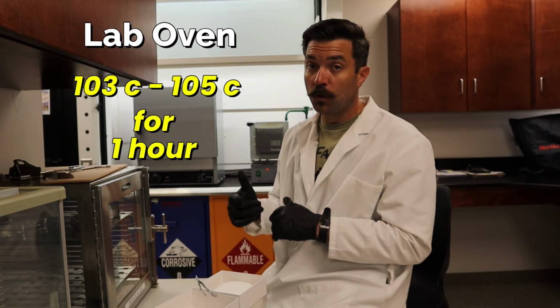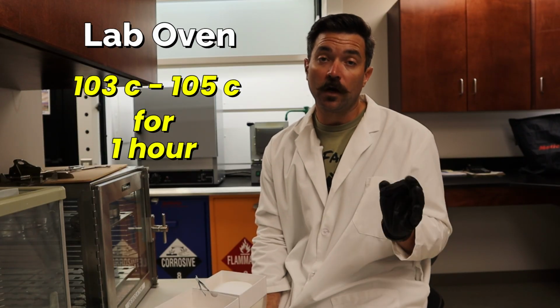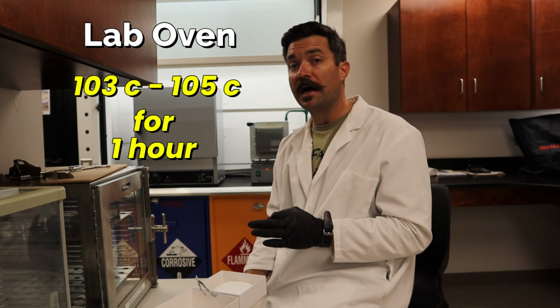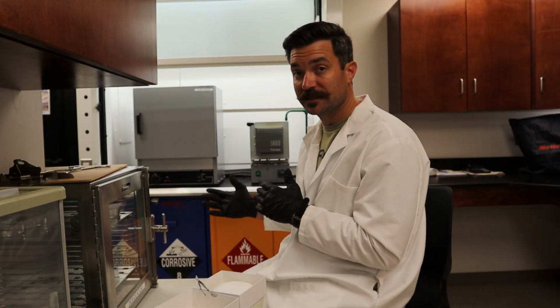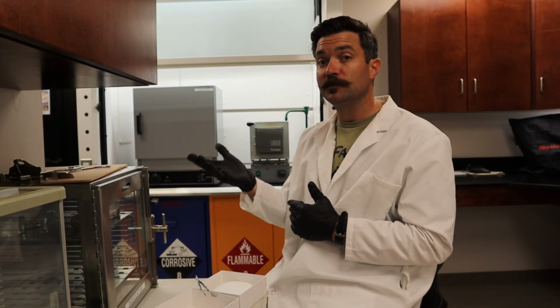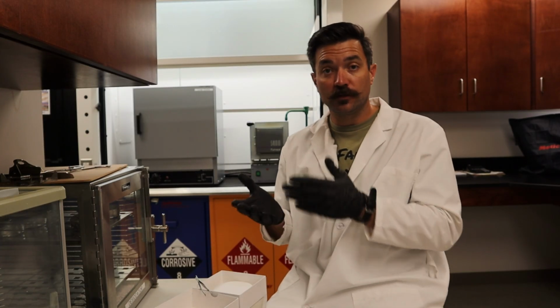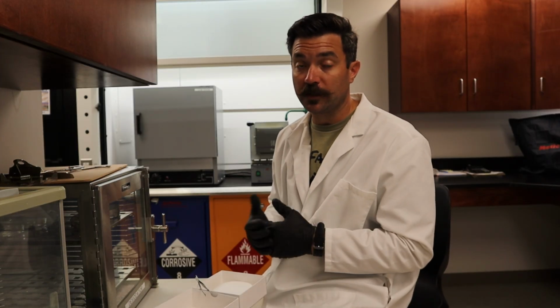The lab oven, very important for your exam to know, has to be set between 103 degrees Celsius and 105 degrees Celsius. That is the range at which your lab oven is supposed to stay set for the entire hour that your sample is in there. So when you open the door, you're going to notice a temperature drop. It's always a good thing, I like to add another 30 minutes, to make sure it actually rises back up to that temperature range, and that I'm not just pulling the sample out too prematurely. You want to give that sample time to dry.